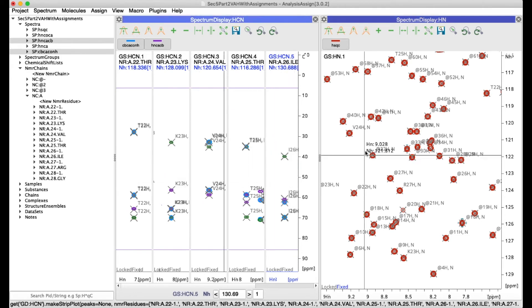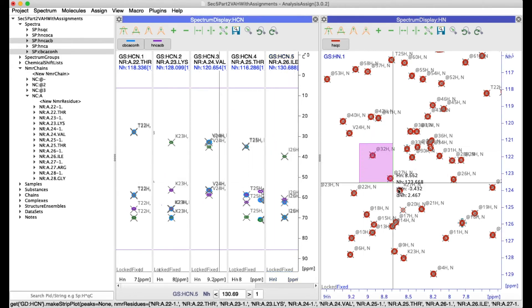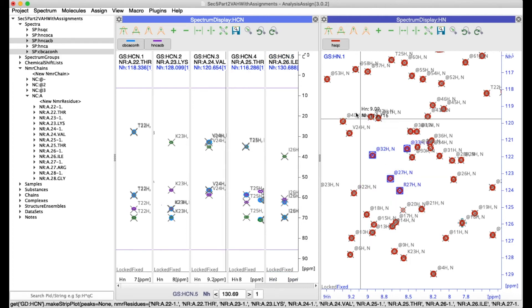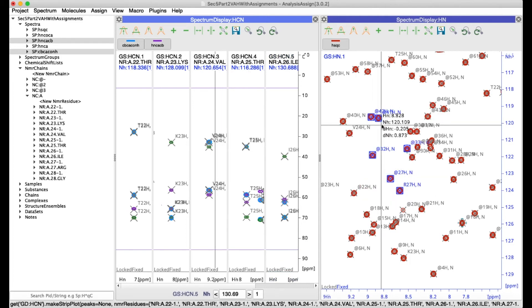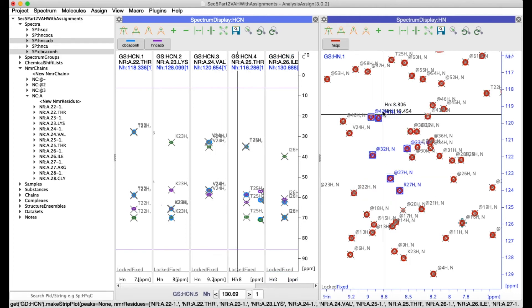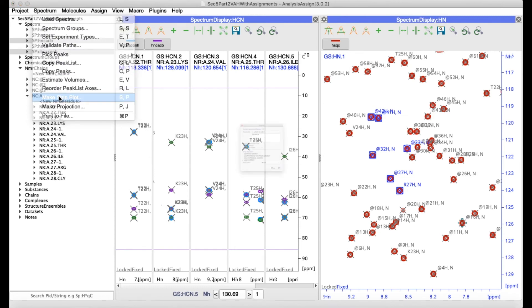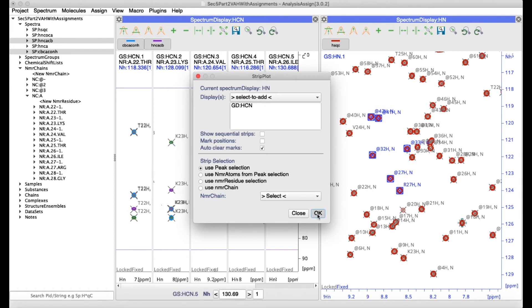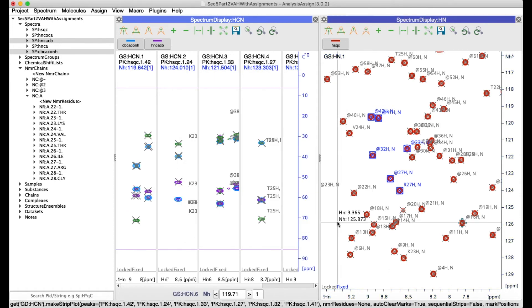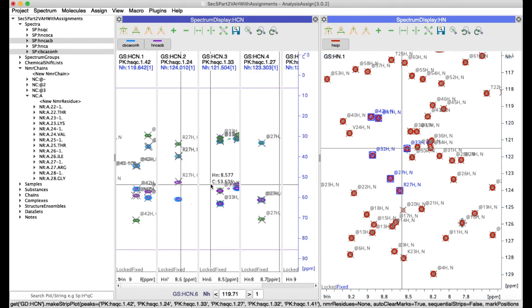Alternatively I could select a number of peaks in another spectrum or I could select peaks in a table and again go to make strip plot and at the same time select use peak selection and then here I've got my strips.